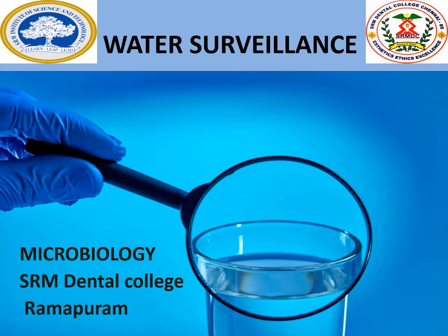Hello everyone. In this video, we will see the water analysis done in the microbiology laboratory in a healthcare system to prevent hospital-acquired infection. Water analysis or water surveillance is information about the disease to prevent the contamination of the illness and further disease outbreak.